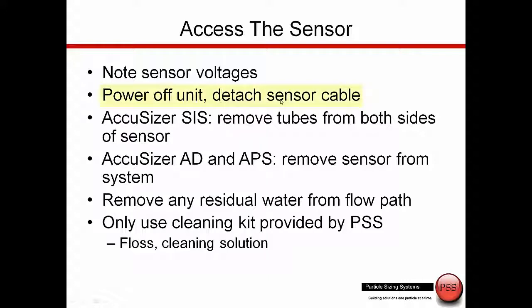Power off the unit and detach the sensor cable. Depending on the unit, we may need to also remove the sensor from the system to have access to the sensor.